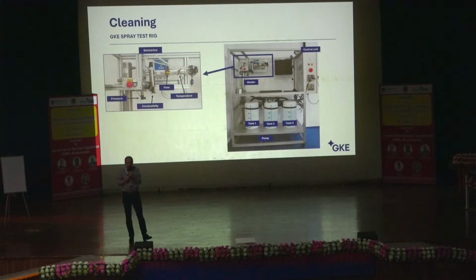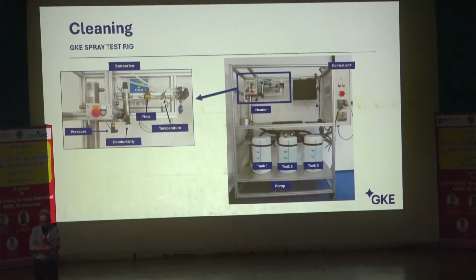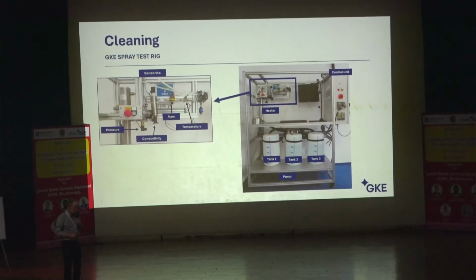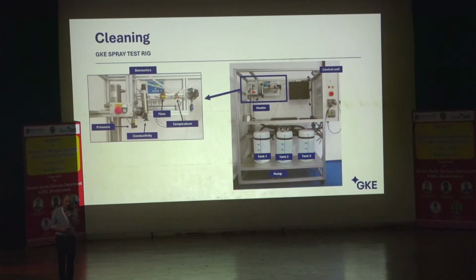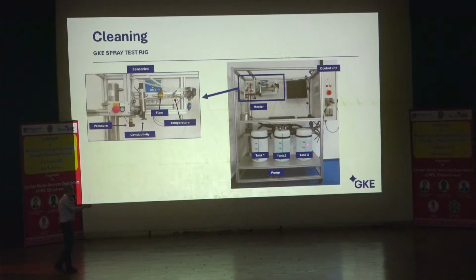And when we do laboratory testing, we need something which is really homogeneous. This is why you can see here on the screen our laboratory test device that we have constructed ourselves in order to get reproducible test conditions. We have a machine which has 3 different containers.